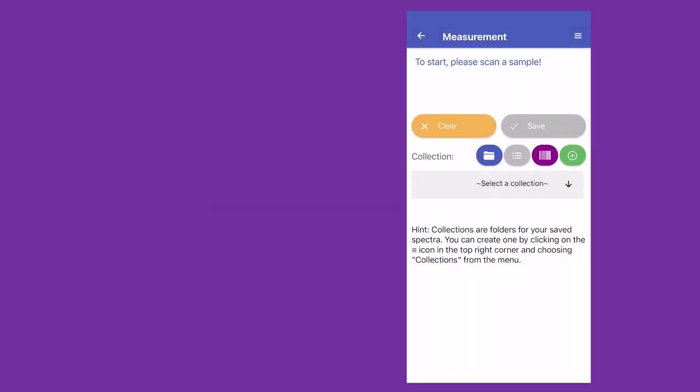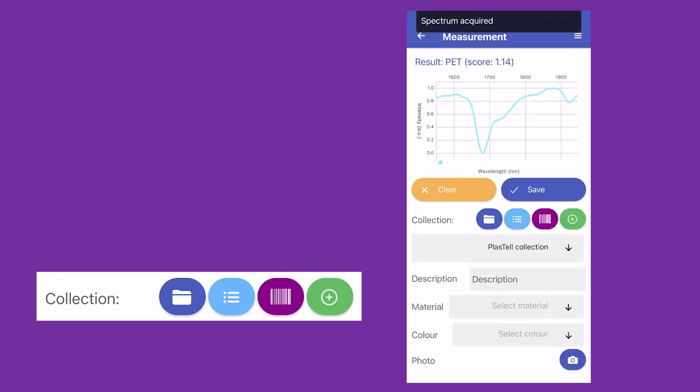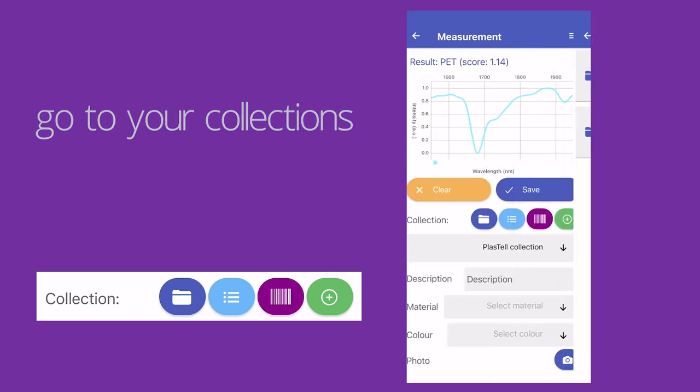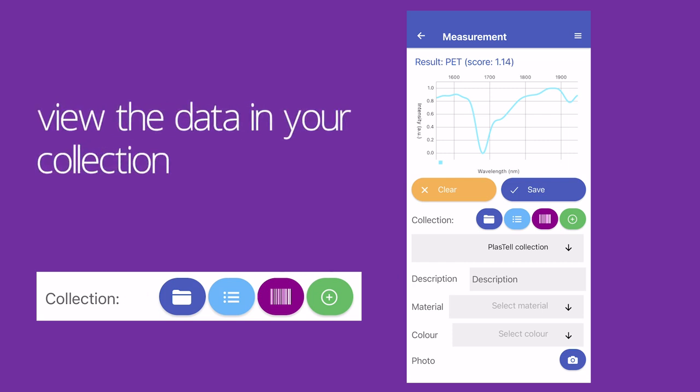When scanning your samples, there are four buttons you can use to access your collections and measurements. The blue button with the folder icon lets you go to your collections. The light blue button allows you to view your data in the collection that you have open.